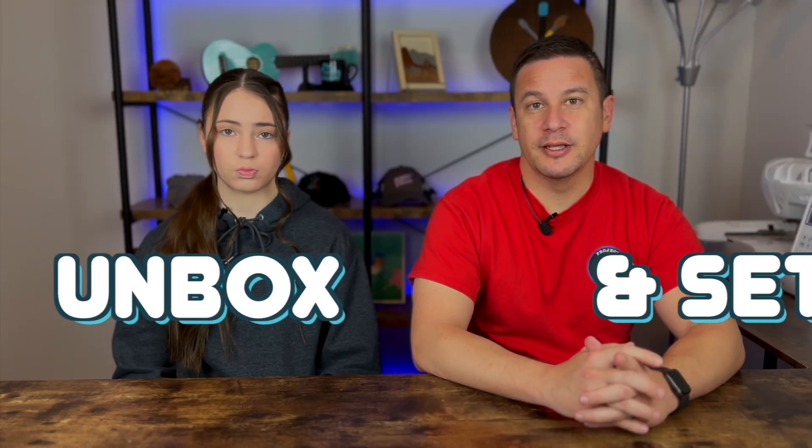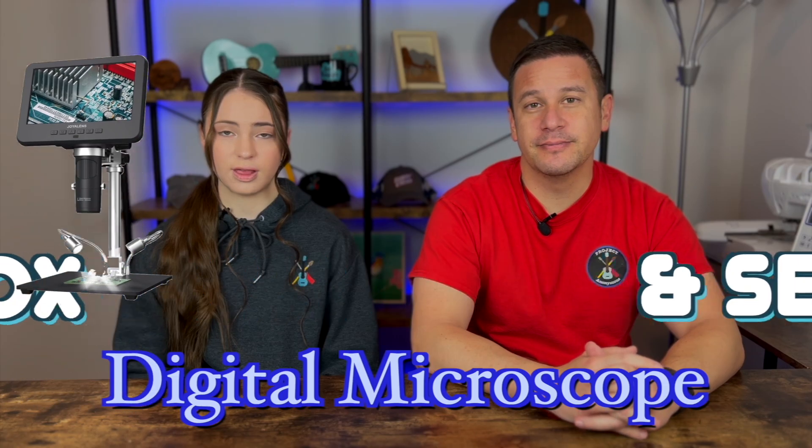Hey peeps, welcome back to Project Anonymous. In today's video, we're going to unbox and set up a digital microscope. So let's get to it.